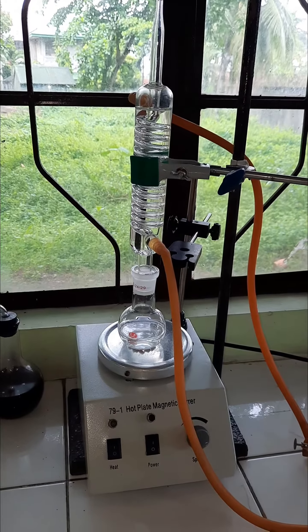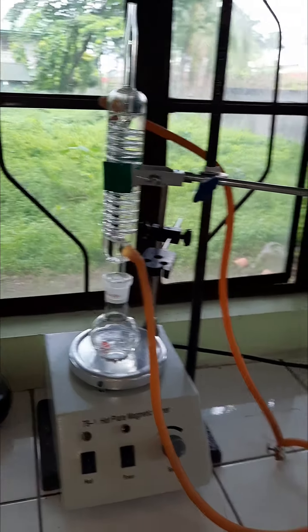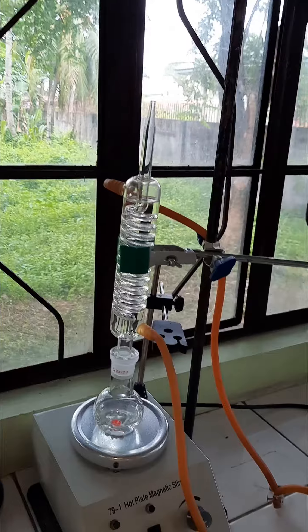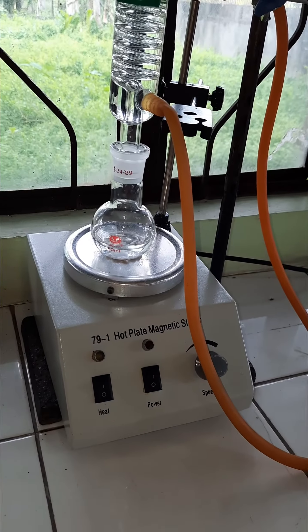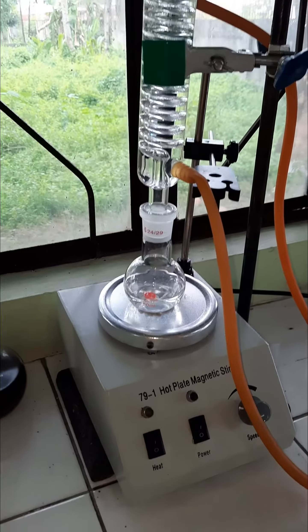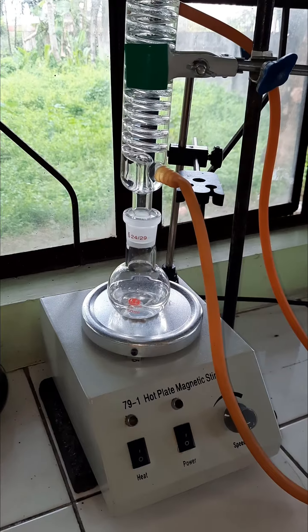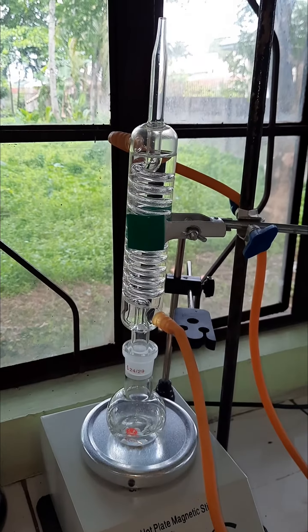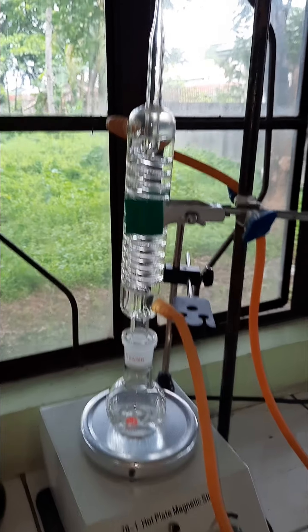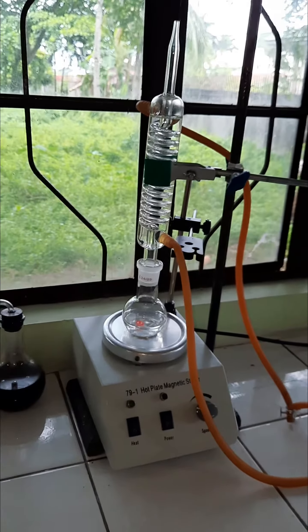So we will witness that process in a little while. As of the moment, I am showing you this setup made up of our heater, our hot plate magnetic stirrer, our reaction flask containing ethanol wherein we will be adding potassium dichromate later on, and of course our Graham condenser acting as our reflux condenser for this reflux reaction apparatus setup.